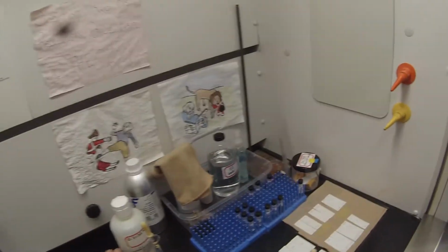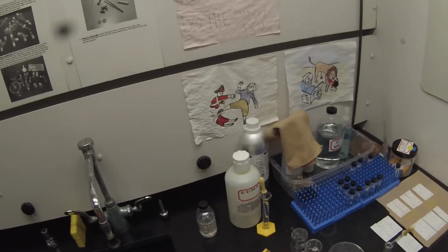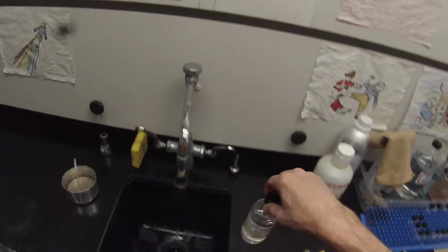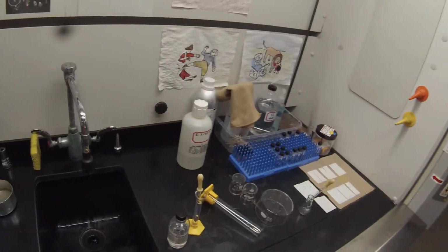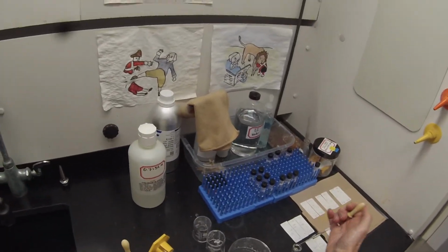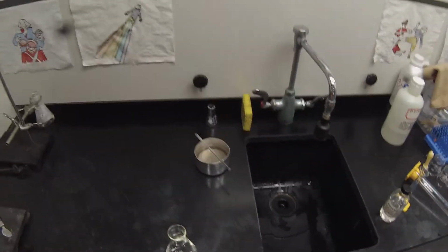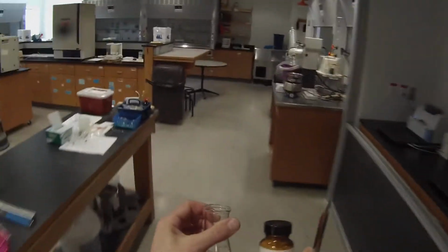And we need to measure 1.8 grams of sodium bromide and dissolve that in a mixture of 6 mils of the 95% ethanol and 5 milliliters of glacial acetic acid. I've still got my pipette that I was using for water. So I'm going to go over to the balance and measure out the 1.8 grams of sodium bromide.